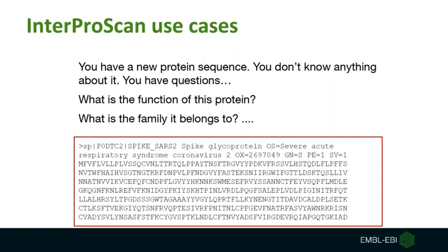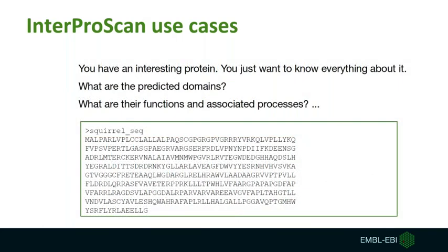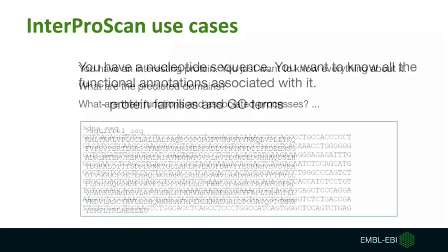One of the use cases is, let's say you have isolated a new protein sequence, and you want to obtain a first-pass profile of the potential functions. So you have questions. What is the function of this protein? What family does it belong to? Others would be that you just want to know everything about it in terms of functional information. So what are the predicted domains for that particular protein? And what are the effects of those predicted domains or any other associated processes?